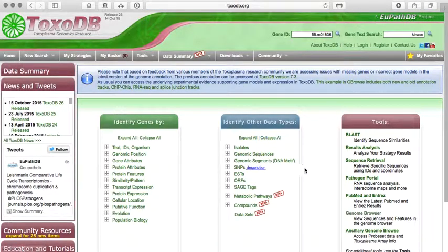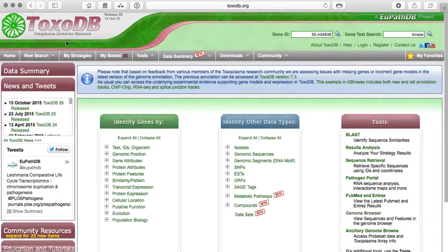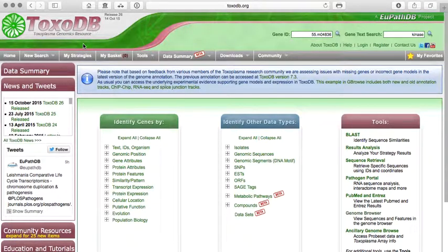Okay, so there, again, there are many, many different types of searches and tools available. And in the end, you're searching information and data surrounding the underlying genomes. And ToxoDB is specific for some of these genomes, including the organism Toxoplasma gondii.